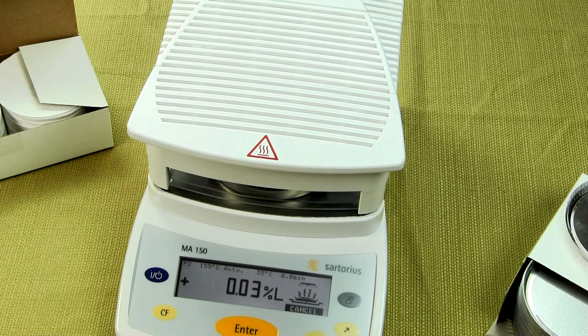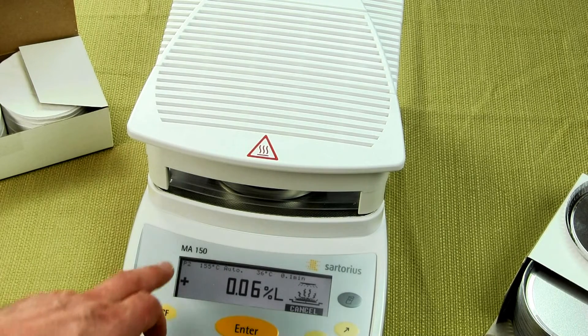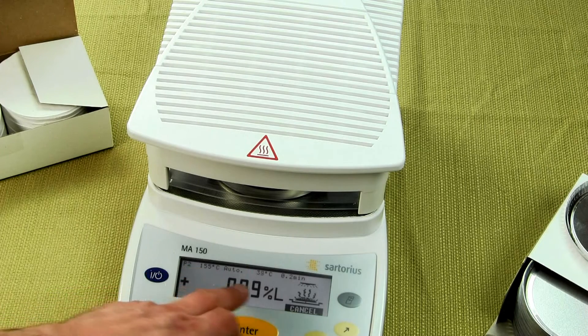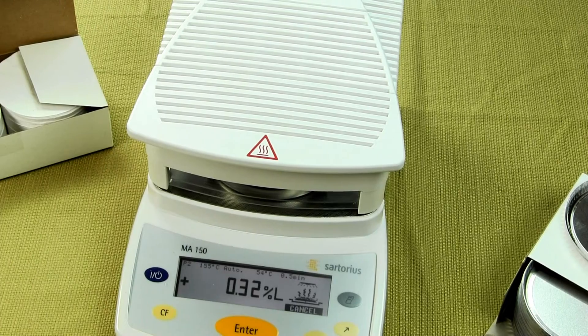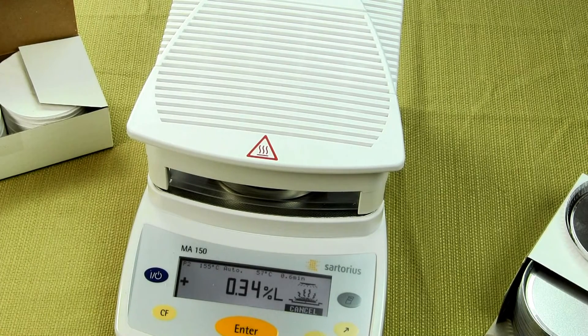You'll see 'L' — this is the percent moisture loss — and the temperature is shown on the display as well. We have program 2 at 155. Right now it's at 38°C. Using ceramic, it will take longer to heat up. But the benefit with ceramic is it's not going to overshoot. With halogen, if you set it at 155, it's probably going to go to about 170 and then pull back. It's much more difficult to control the temperature using halogen versus ceramic.